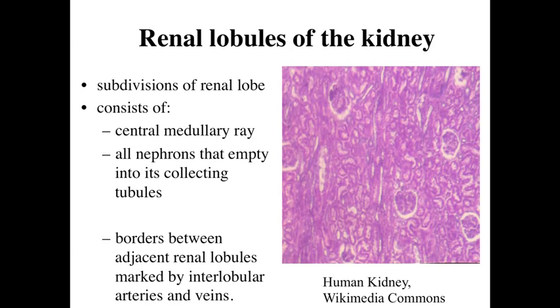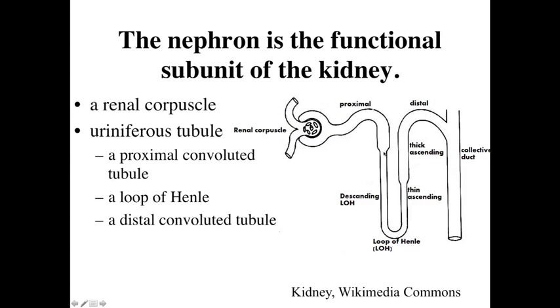Moving back up into the cortex, subdivisions of the renal lobes are going to be the renal lobules. What's defined is a central medullary ray. We can see collecting tubules running up and down at various positions, all running roughly parallel to one another — these are the central medullary rays. Then we have all of the nephrons, with glomeruli and renal corpuscles with proximal convoluted tubules all twisted around, ultimately draining into a central medullary ray. So the nephrons and the collecting tubules and collecting ducts within the medullary ray represent the renal lobules.